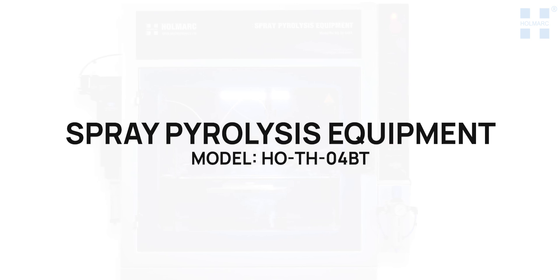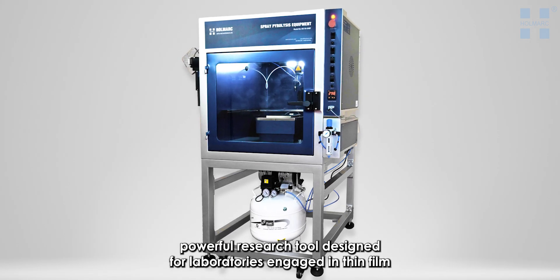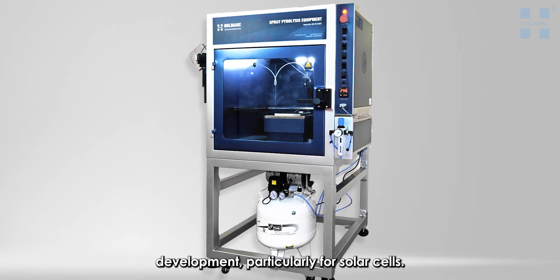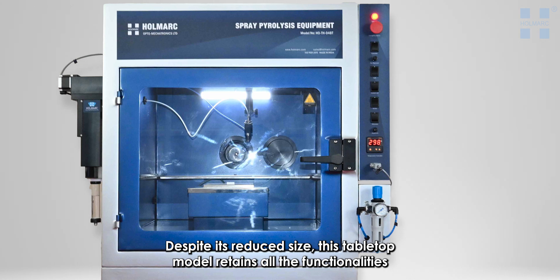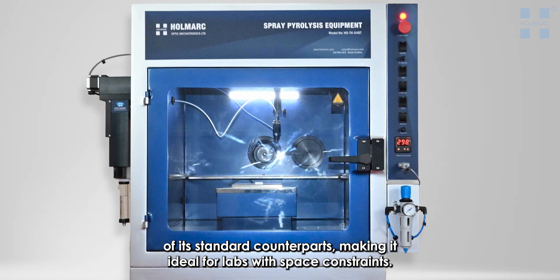The spray pyrolysis equipment model HO-TH-04BT by Holmarc is a compact yet powerful research tool designed for laboratories engaged in thin film development, particularly for solar cells. Despite its reduced size, this tabletop model retains all the functionalities of its standard counterparts, making it ideal for labs with space constraints.